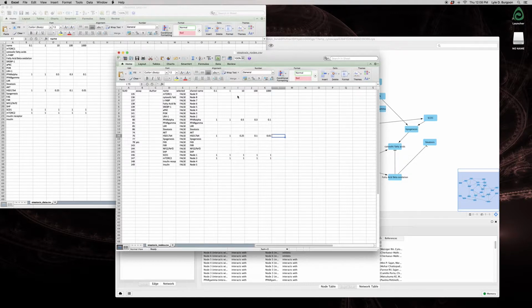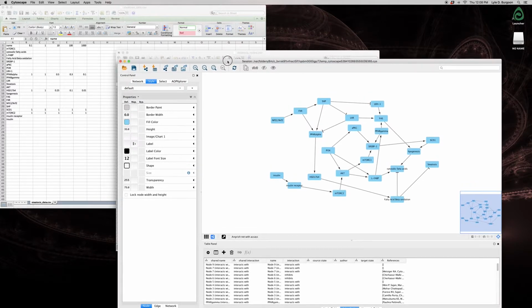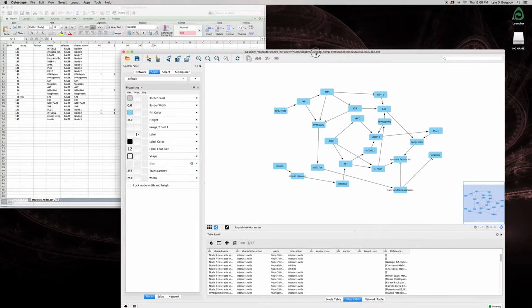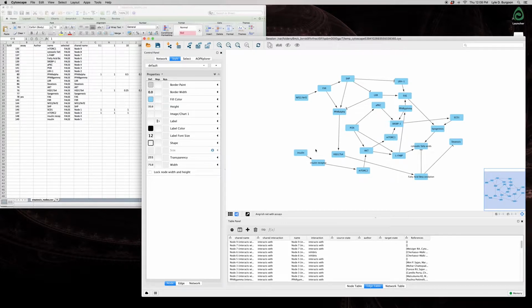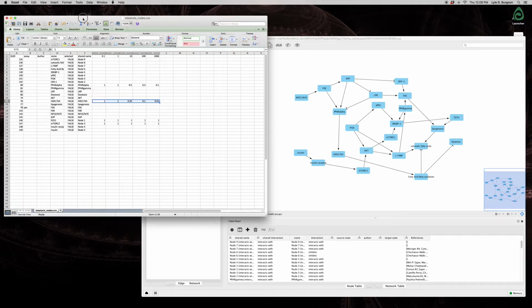So what we see here is as the doses increase, we have for PPAR alpha a net decrease in the expression of that particular gene. Same thing for HSD17B4. Now, if you remember in the network here, we're actually talking about proteins, not genes. So one of the questions you might have is, why are we putting gene expression data on top of what is seemingly protein networks? And this is a fairly common practice.